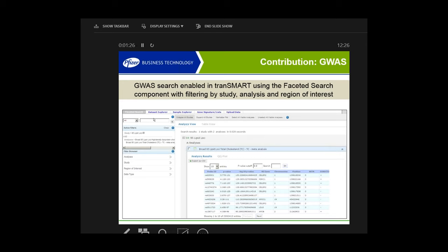We utilized the faceted search that was developed by J&J as a way of implementing this. What you're seeing here is a new tab within Transmart specific for Genome-Wide Association studies. When you open this tab up, you see a listing of all the Genome-Wide Association studies that we have. If you click on those studies, you get a listing of the individual analyses. The 95 lipid loci GWAS set, which is a public set — as soon as you open it, you get immediately back a list of the top 500 significant SNPs for any analysis that you open.